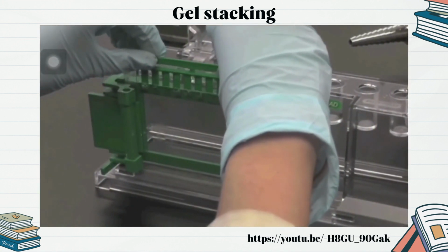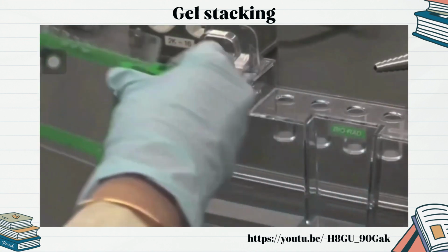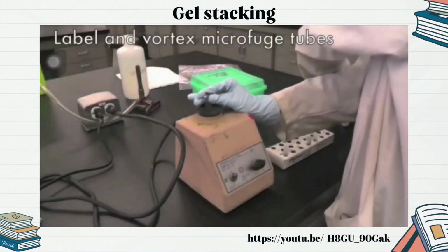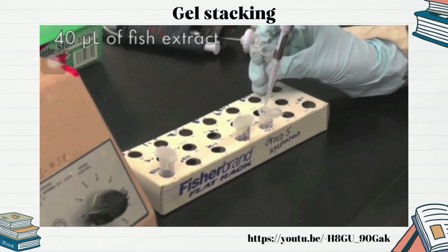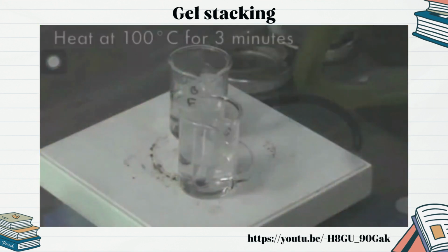After the gel is formed, unclip the casting frame with the gels from the casting stand. Remove the glass plates from the casting frame. For SDS page, label the microfuge tubes corresponding to your samples. Pipette 40 microliters of the fish extract and add 40 microliters of the sample buffer.